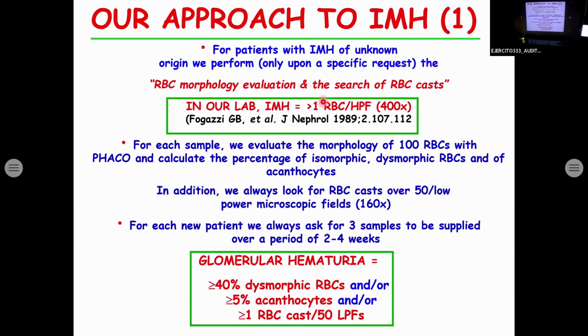We examined the urine sediment after collection of the second morning urine, produced over 2 hours. We have a standardized method for urine sample preparation. We use centrifugation of 10 ml of urine put into a glass graduated tube with conic bottom.